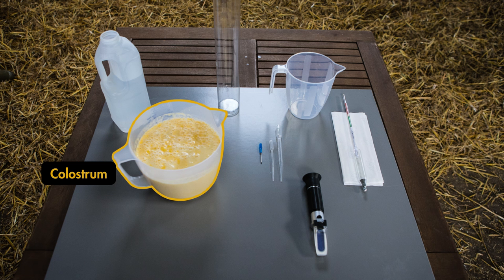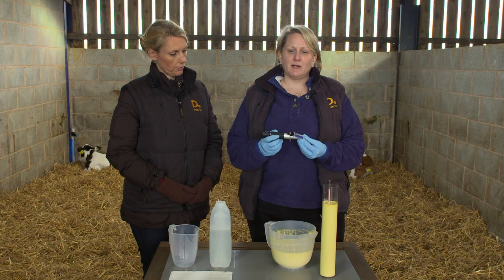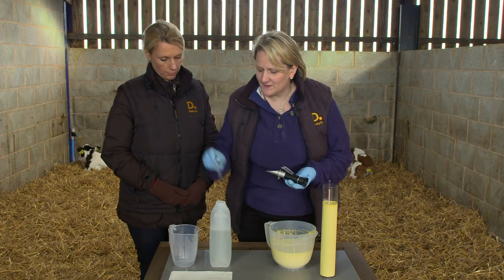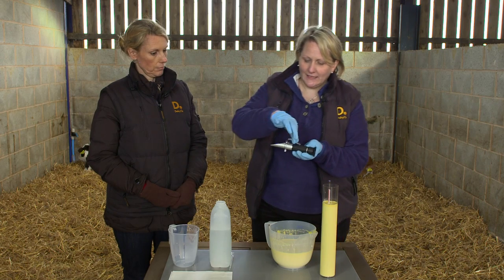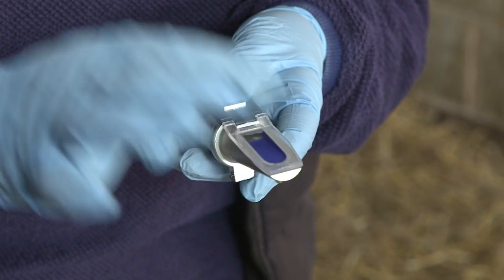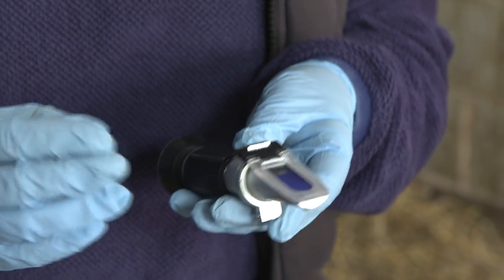To test using a brix refractometer, you'll need clean water, clean tissues, and the refractometer itself. Before using the brix refractometer, we must always calibrate it. We do this by taking a few drops of distilled water and putting it on the glass. Just a couple of drops are required. We then gently close the lens cover across it, taking care to avoid air bubbles and dry patches. You should allow 15 seconds before attempting calibration to allow the liquid to adjust to ambient temperature.